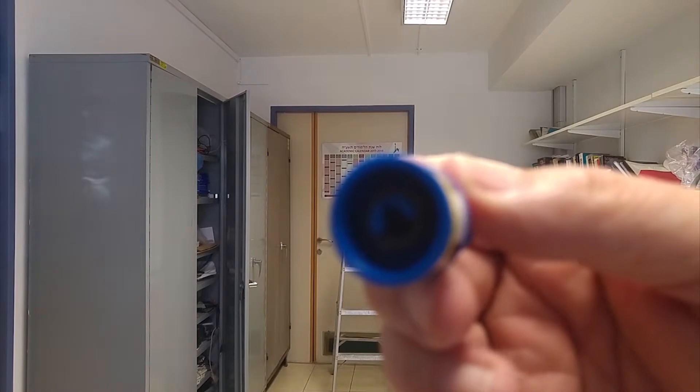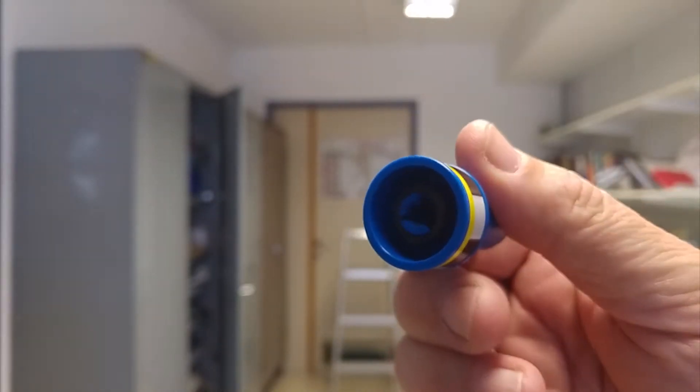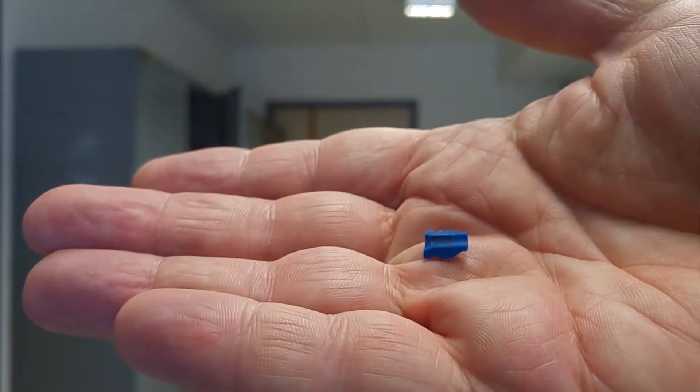And indeed, after being dropped twice, it actually broke. Here's the piece to prove it.